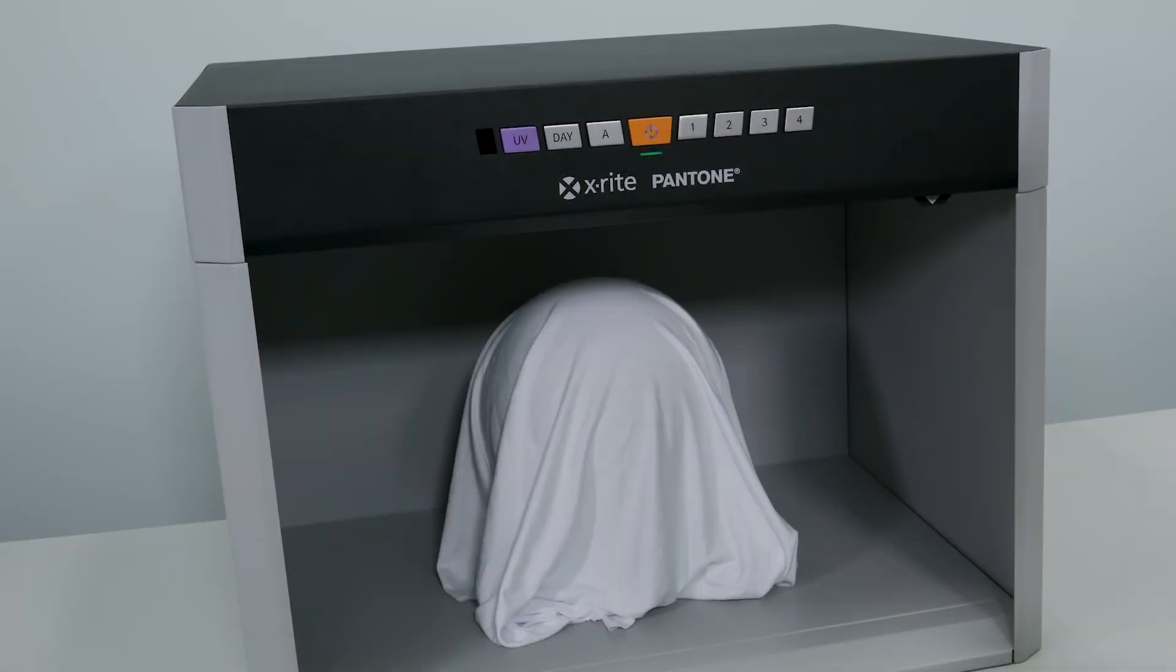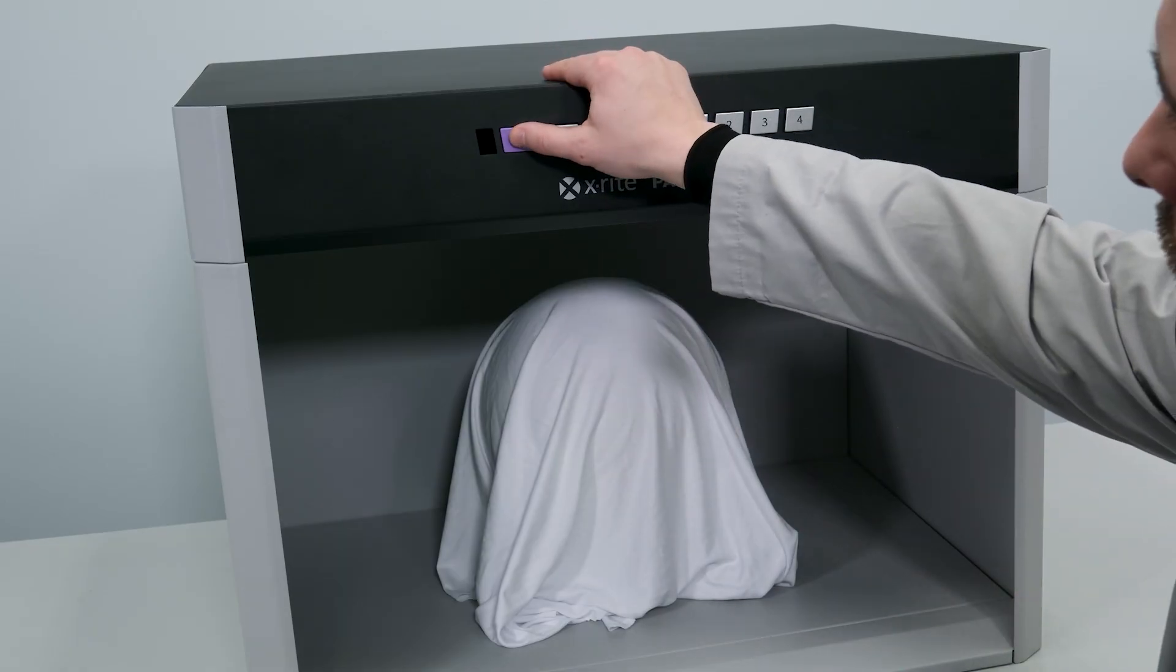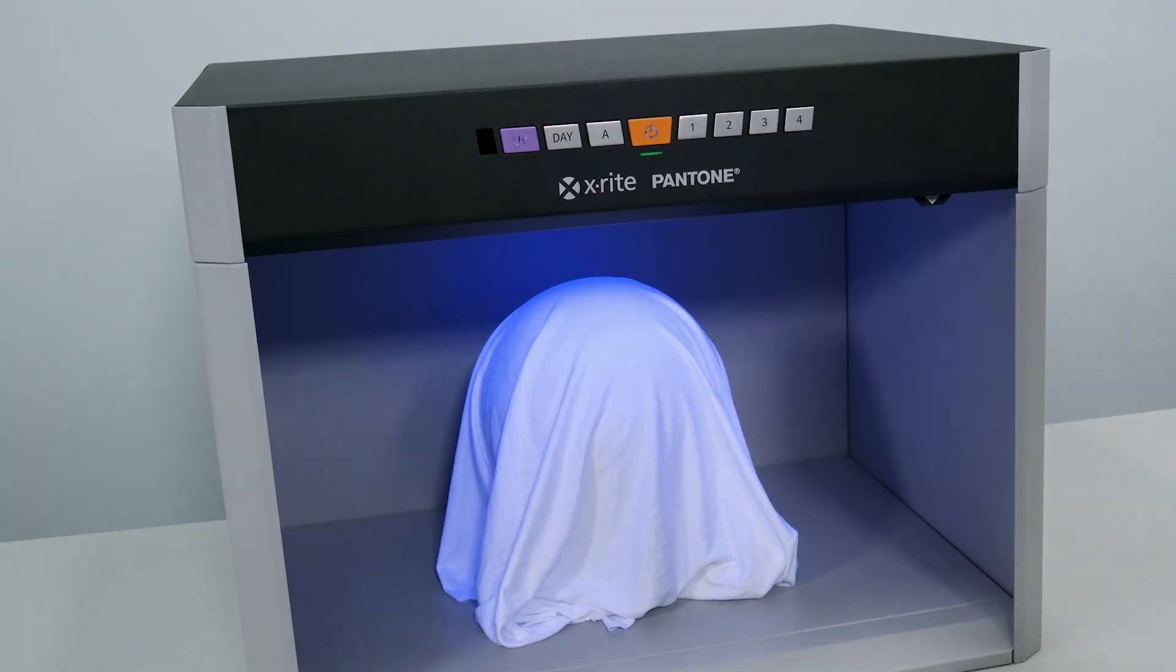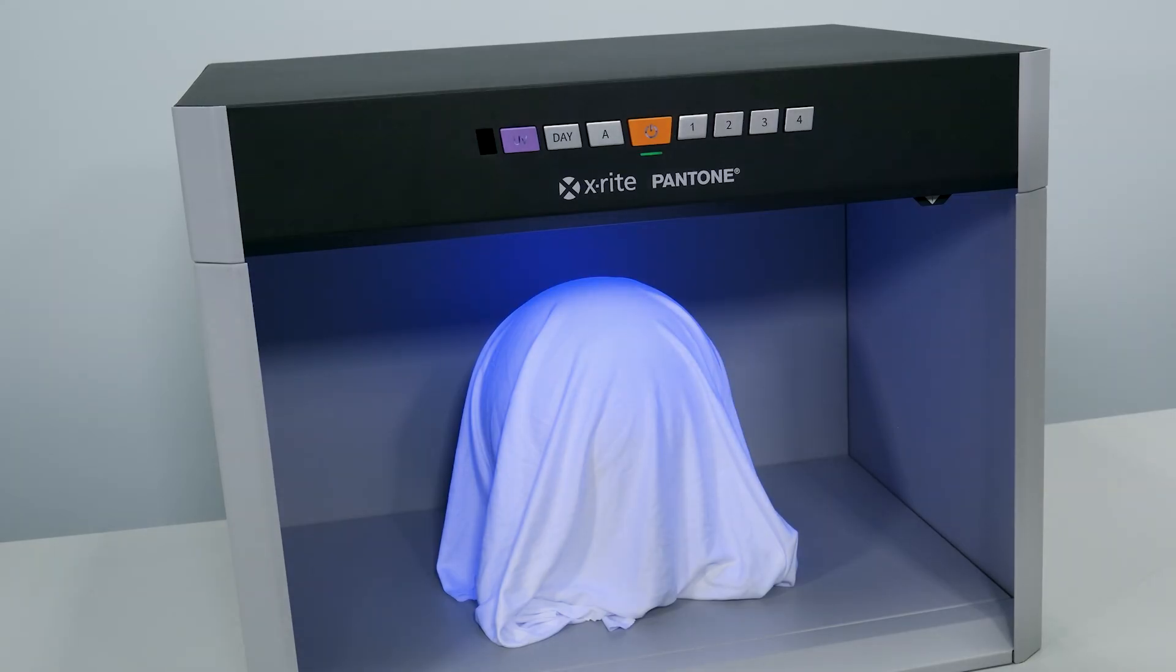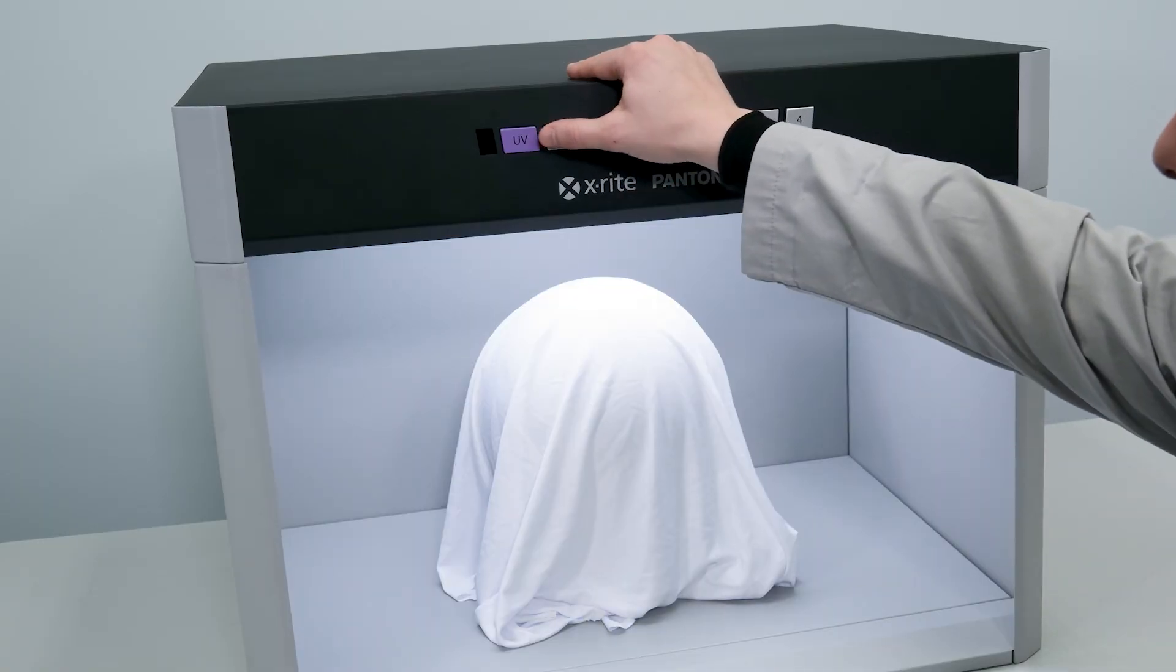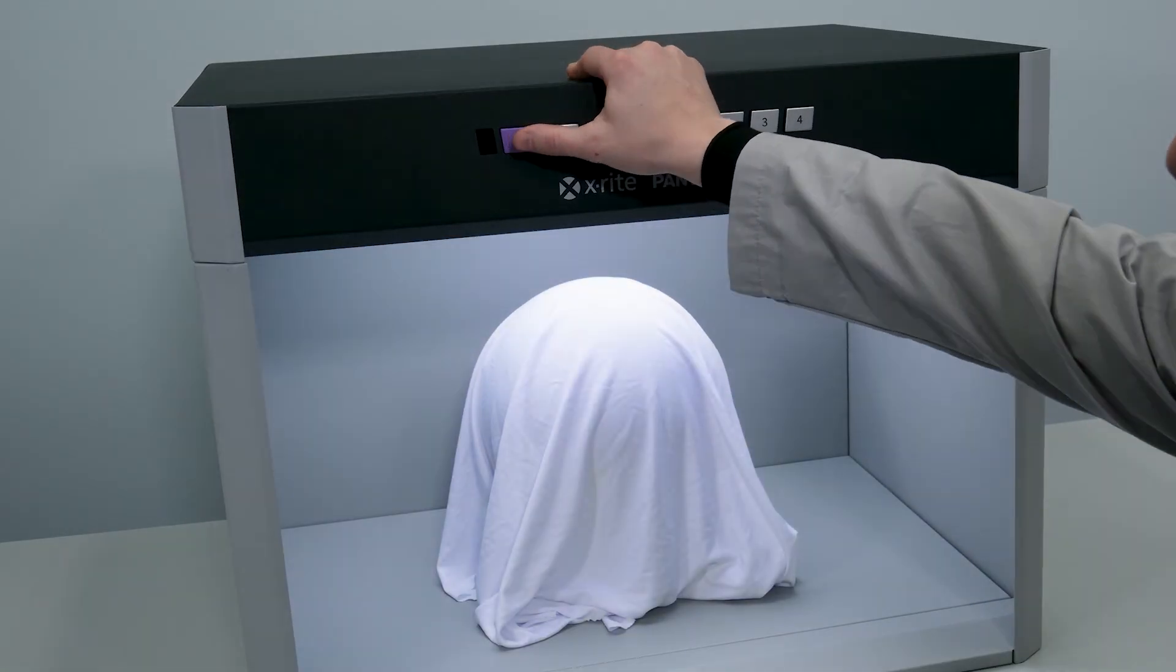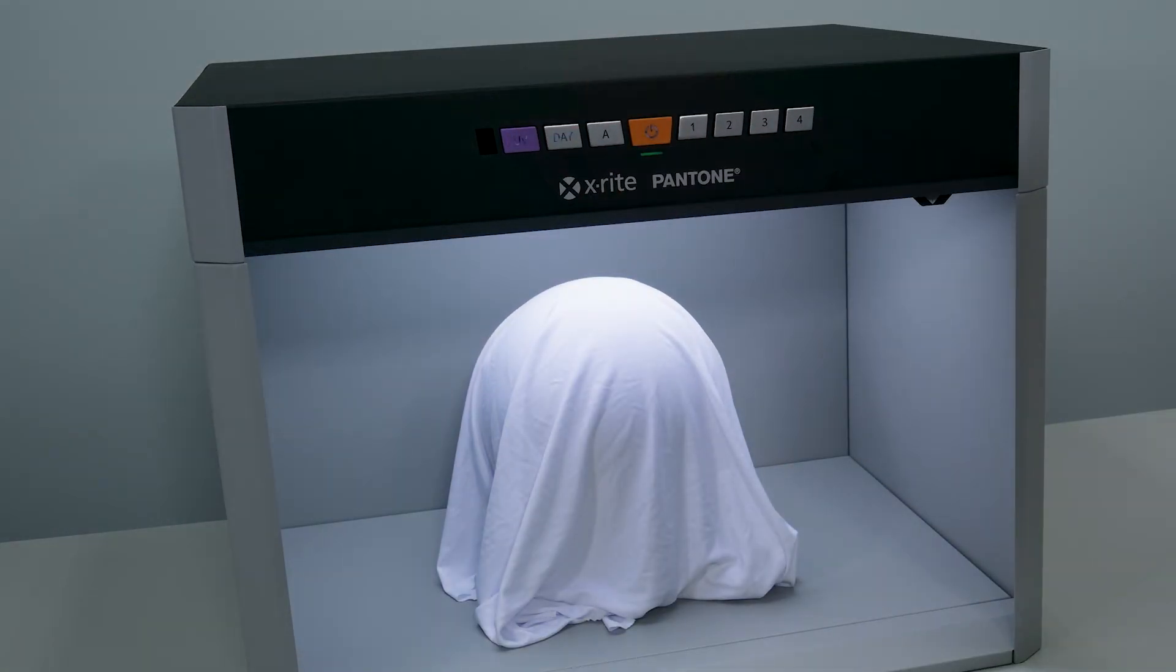For samples containing optical brighteners, whitening agents, or fluorescent dyes or pigments, the UV button can be used. This can be used as a standalone or in combination with D50 and D65 by pressing the corresponding illuminant button and then pressing the UV button.